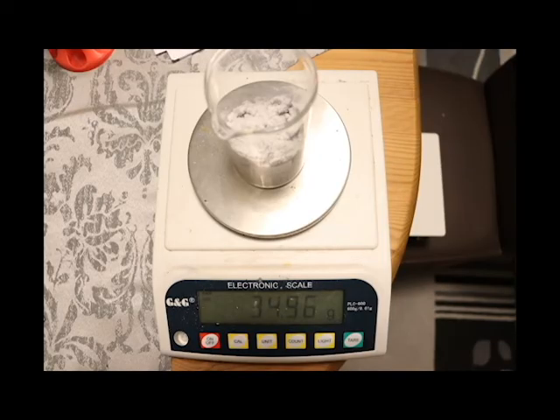After we let our oxalic acid dry in the vacuum desiccator for a day, this is our final result. We collected 34.96 grams of oxalic acid, and the theoretical amount would be 35.71 grams, which corresponds to a yield of 98%.